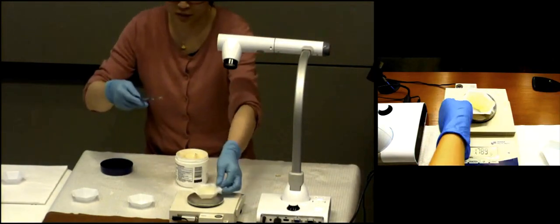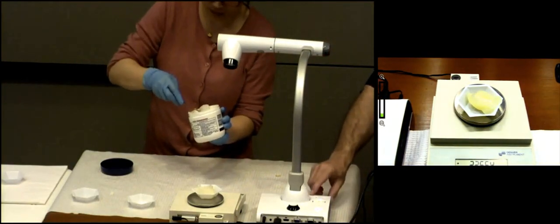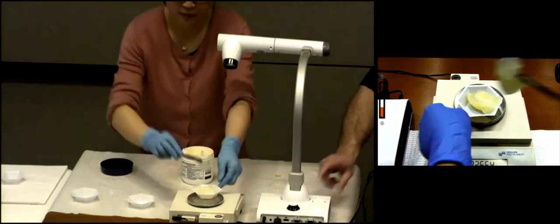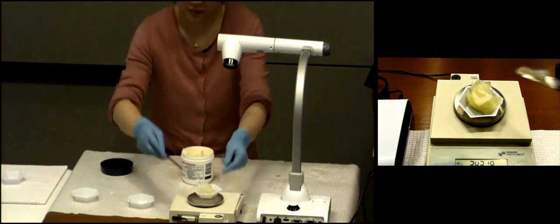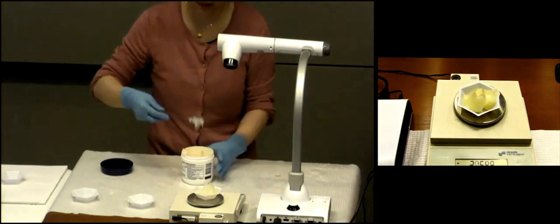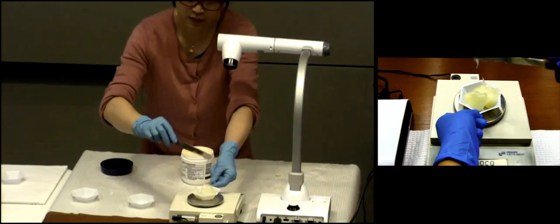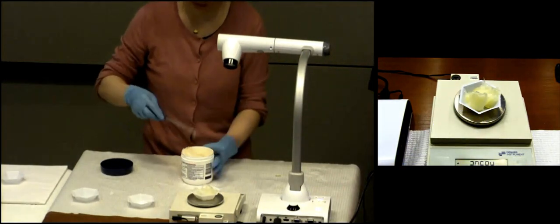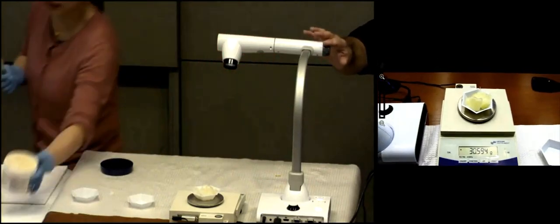Ooh, what color is that? A little bit yellowish in color. Do you see it? Ooh, look at it standing straight up there because it's kind of stiff. So it's yellowish, it's stiff, it's greasy, it's not water washable, it's an ointment. That is the definition of an ointment. All right, we are happy with this measurement.